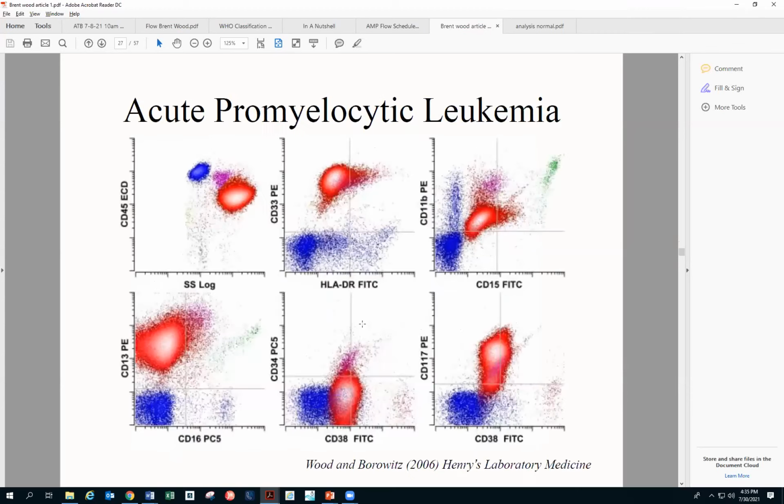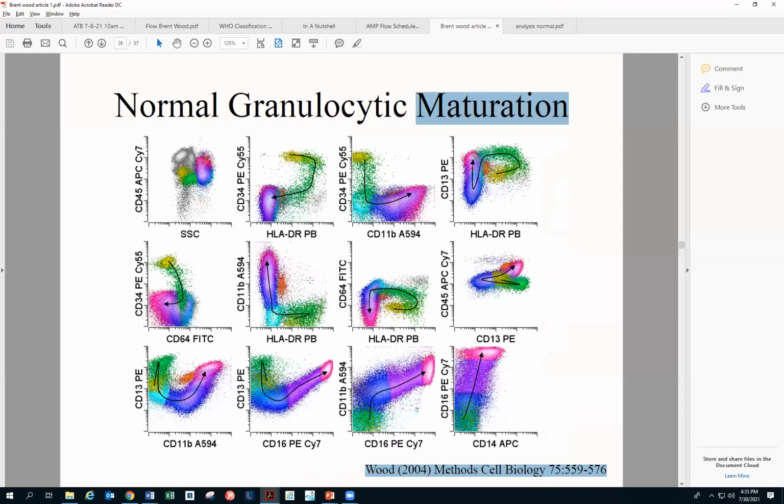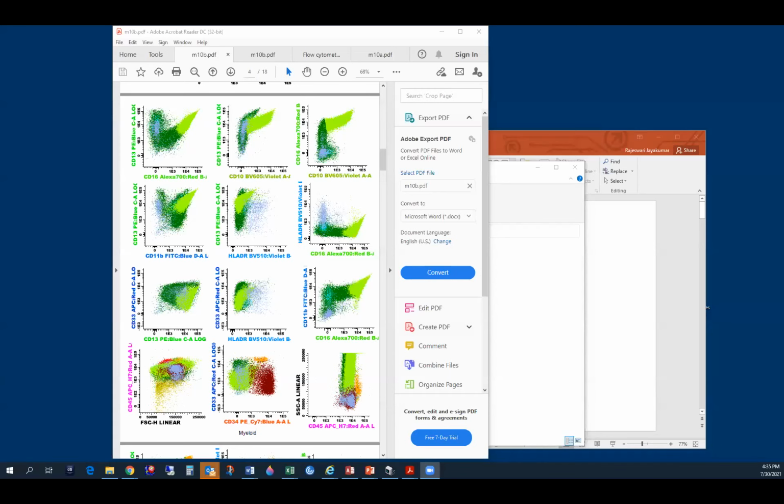Hi, can I ask you a question? Yeah, sure, Shweta. I was just wondering, can we use 4 and 14 to separate monocytes from the myelocytes? Because these are the markers which are very less prominent in the myeloid and are always in the monocytes. So when we gate, can these be used? Because most of the other markers have overlap between myeloid and monocytes. So for gating purposes, 14 is a very good marker.